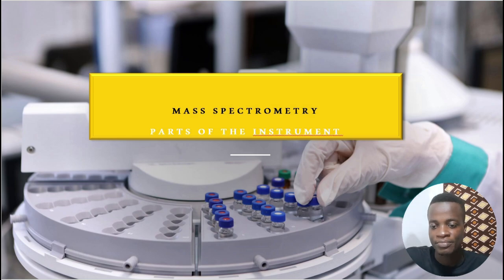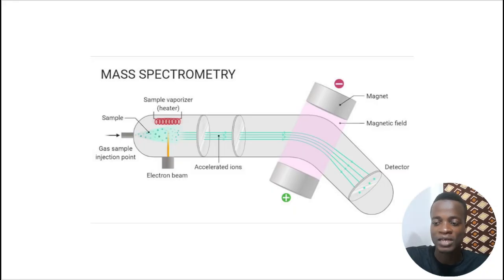So this is the instrument that we have. We have a picture of it. We have 5 different versions, but they all have the same parts. They play the same basic roles, which we want to look at. So let's look at the various parts of this thing.